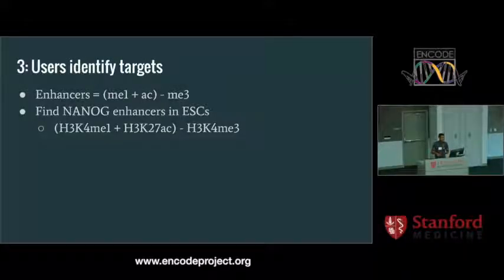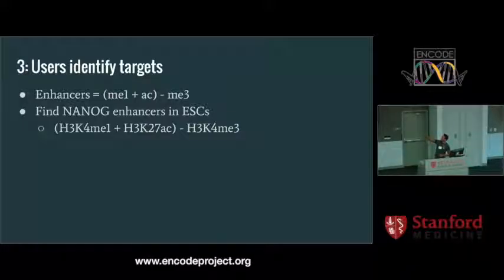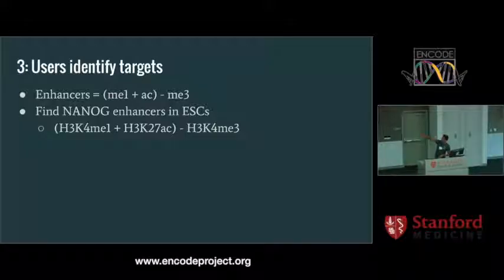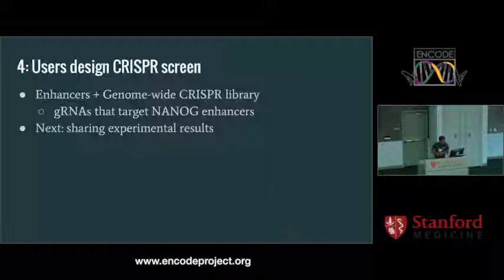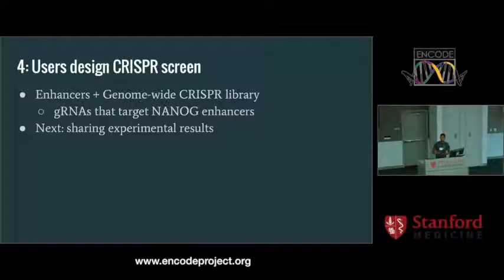For example, say you want to find NANOG enhancers — you want to CRISPR NANOG enhancers in embryonic stem cells. You need two activating chromatin marks: a monomethylation and an acetylation. The plus indicates genomic interval intersection and the minus is subtraction, so we're looking for areas that have monomethylation and acetylation but no trimethylation. Using this friendly user interface, you can now find enhancer targets for NANOG. You then take those NANOG targets and intersect them with the genome-wide CRISPR library to get guide RNAs that target your enhancers of interest.